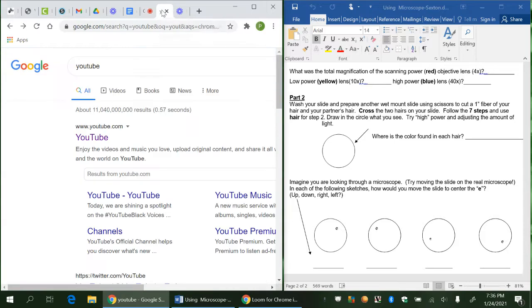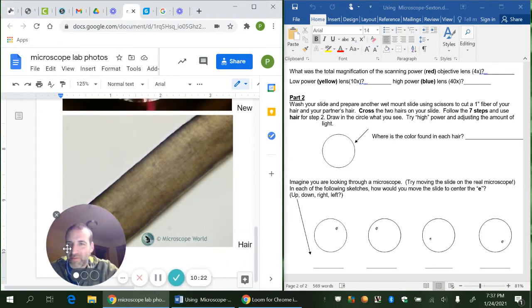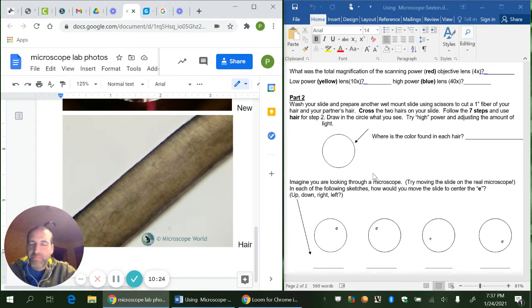So I've got a picture of a piece of hair under high magnification here. But as I was saying, it's crazy to see different people's hair under a microscope. If you've got dark, thick hair, it's going to look something like this one in the picture. If you have darker, thin hair, like me, because I'm old and I'm going bald, it's going to be about half this thickness. If you have blonde hair or reddish hair, it's almost see-through.